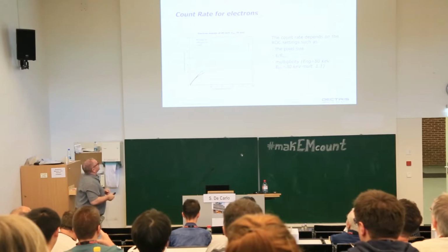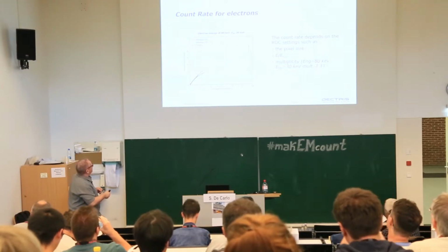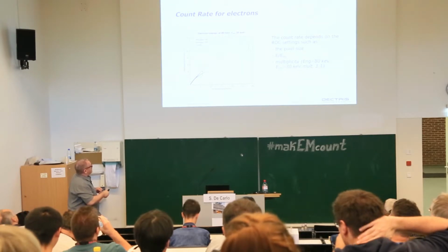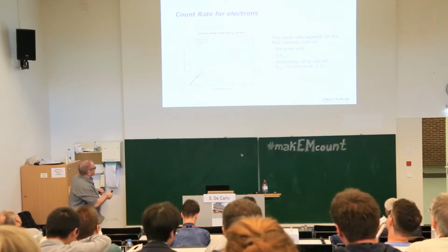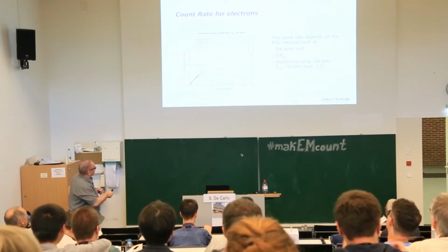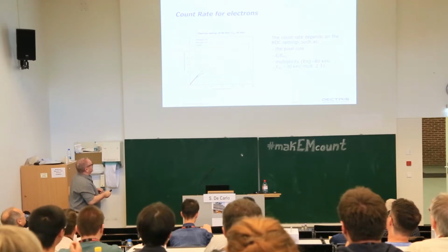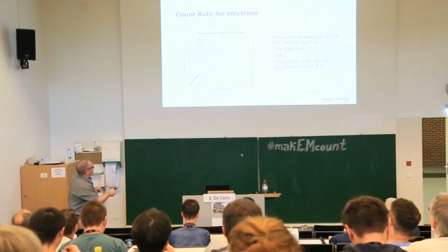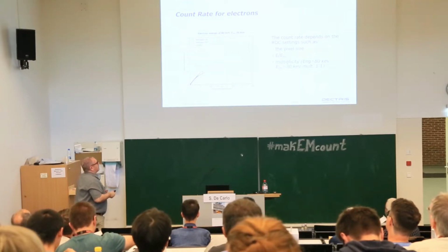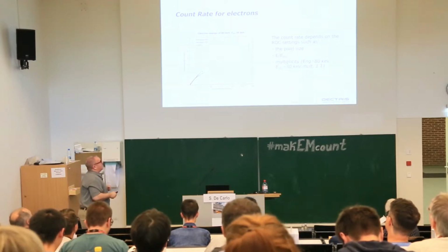And this is it. So basically here we have a graph showing the incoming count rate in mega counts per second, and this is the measured rate. As I said, ideally you would want this to be linear, but when the count rate goes above 30, 40 mega counts, with the retriggering off, you have a plateau here, and you have a limit above this, around 5 times 10 to the 6. It's difficult to count, and in this case, with the retrigger on, you can extend your count rate to about 30 megacounts.